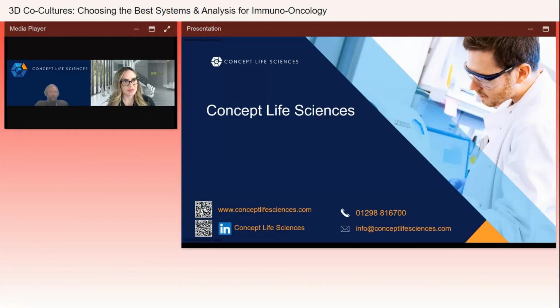And obviously then you could ask questions about whether or not things can get in to activate them, especially in those really dense spheres. But yeah, it's certainly doable. It'd be interesting to see how they distribute and things, because obviously the cancer cells are going to move up around them quite rapidly. Whether or not the T cells go with them, I don't know.